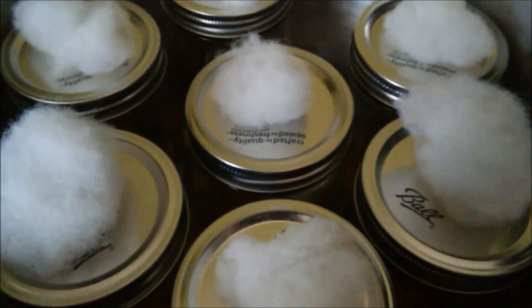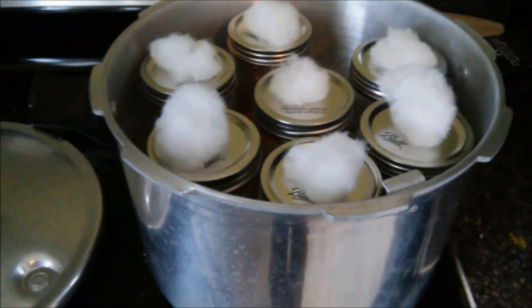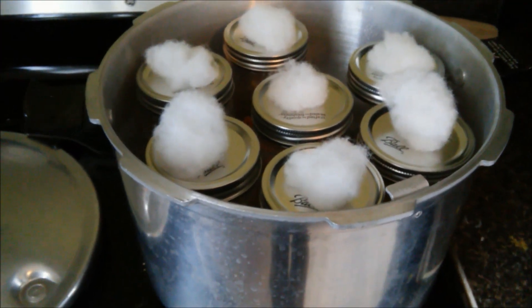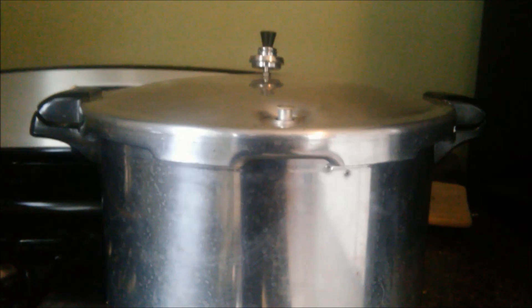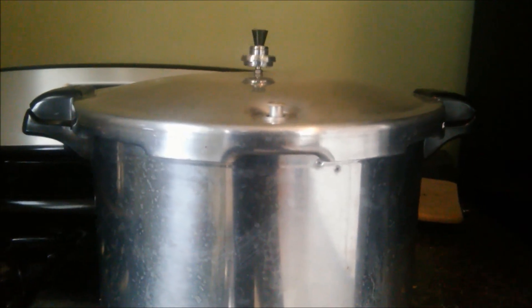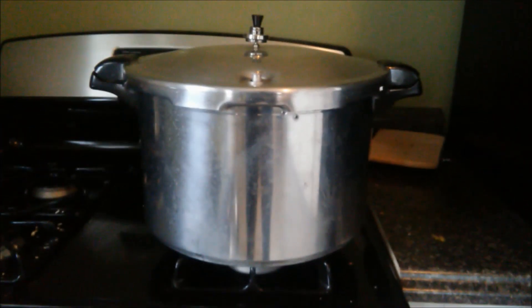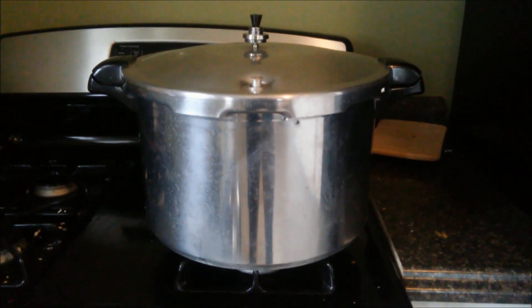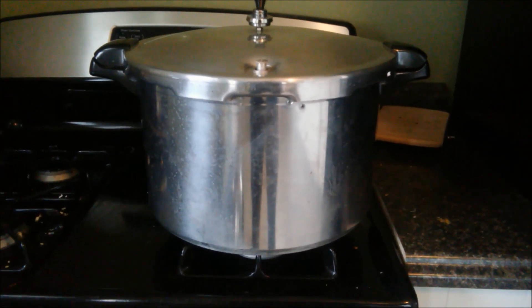Fill your pressure cooker with water up to where the corn level is. You're going to want to bring this to where it starts pressure cooking, and we're just going to let this sterilize for an hour. About 45 minutes has passed and we just turned off the heat — it will maintain its pressure for about 20 more minutes, giving us our hour of sterilization.